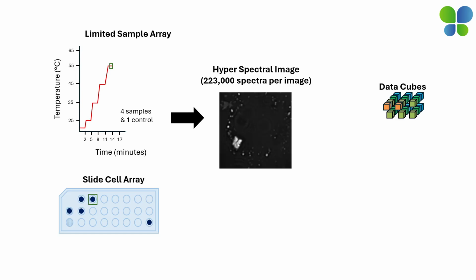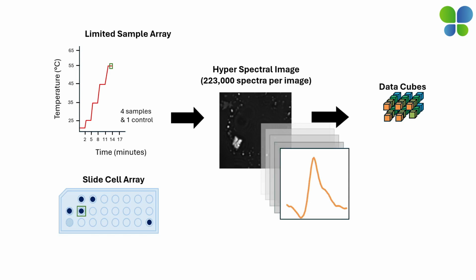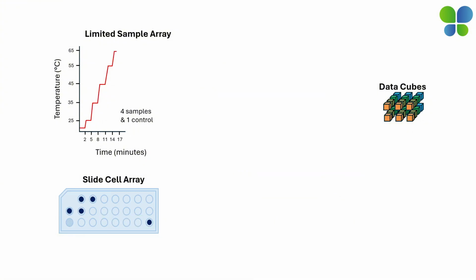The real-time acquisition of the field of view allows for minimal fixed volume requirements and the assurance of the image captured to be representative of the distribution population of therapeutic proteins in their formulation. This snapshot in time, at a given temperature, allows for the true comprehensive comparability assessment of all the samples in the array.